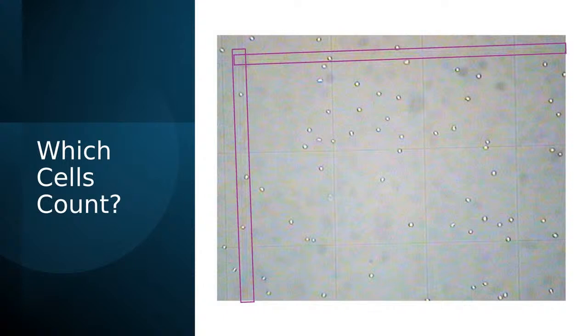And I would say that's a pretty good density of cells. Like, there's not going to be too many to count. I know some of the squares of that major square are cut off right now, but generally, right, we look for something to be less than 150 per major square to be considered countable and reasonable to count with our eyes.